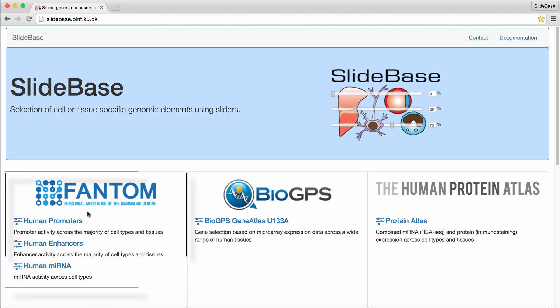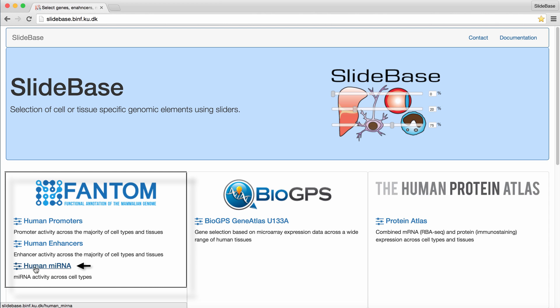The Phantom Promoter Atlas enables the selection of promoters based on CAGE expression across human primary cells and tissues. Similarly, the Phantom 5 MicroRNA Expression Atlas enables selection of microRNAs across many human primary cells based on small RNA sequencing. Finally, the Phantom Enhancer Atlas enables selecting enhancers based on their activity in the same tissues and primary cells as the Promoter Atlas.